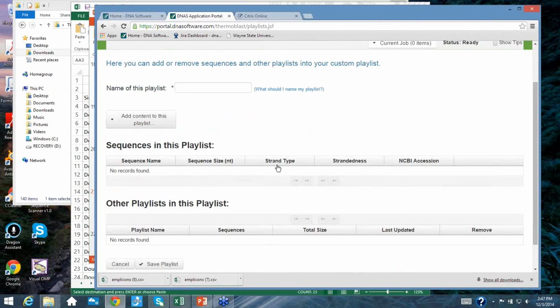And even within the X chromosome, it will show you all of the hits that are found. As long as they're extensible, they will be shown as individual hits. If they're not extensible and probes, it will show those hits. If they form amplicons, it will show all the amplicons. So the answer to that question is basically yes.